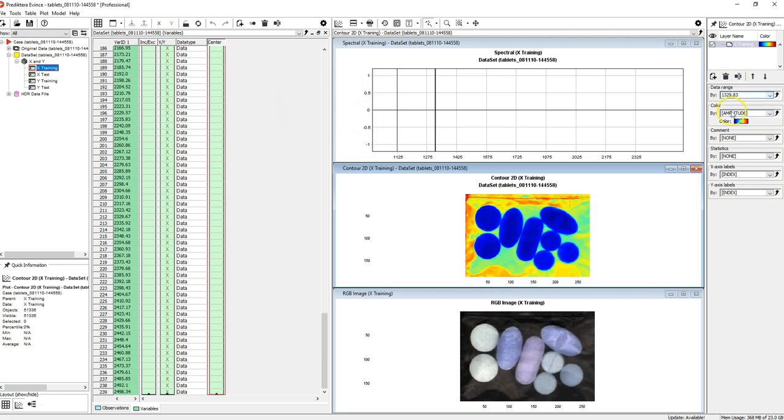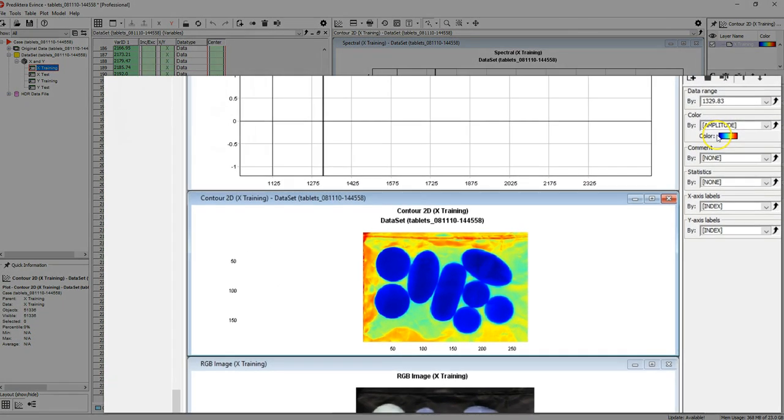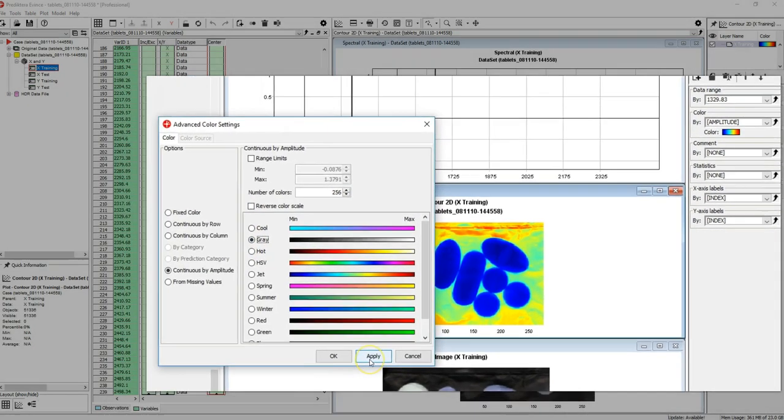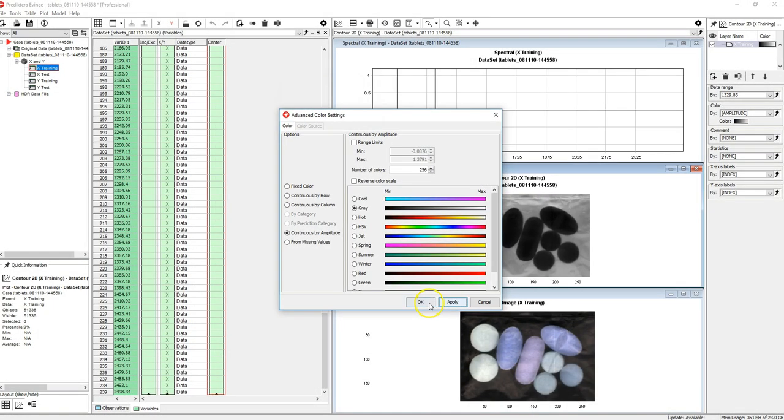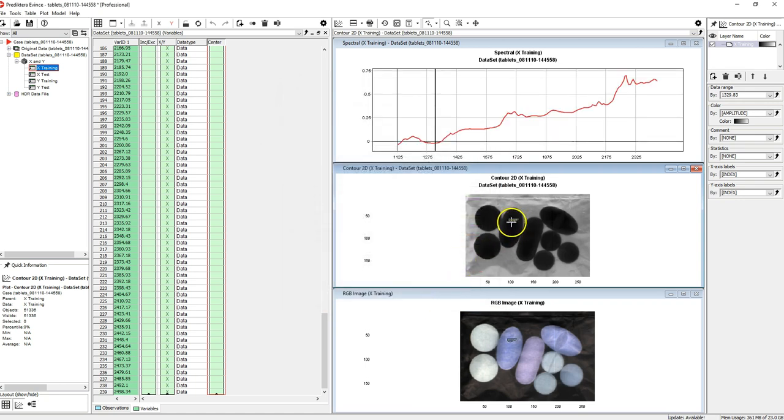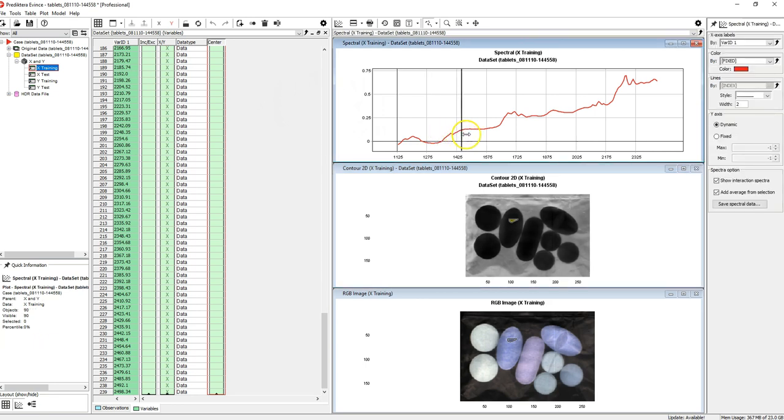In the settings menu we can change the coloring being used for this contour plot to be grayscale. In this way we can clearly see the difference between the pixels when looking at the absorbance in a single wavelength.